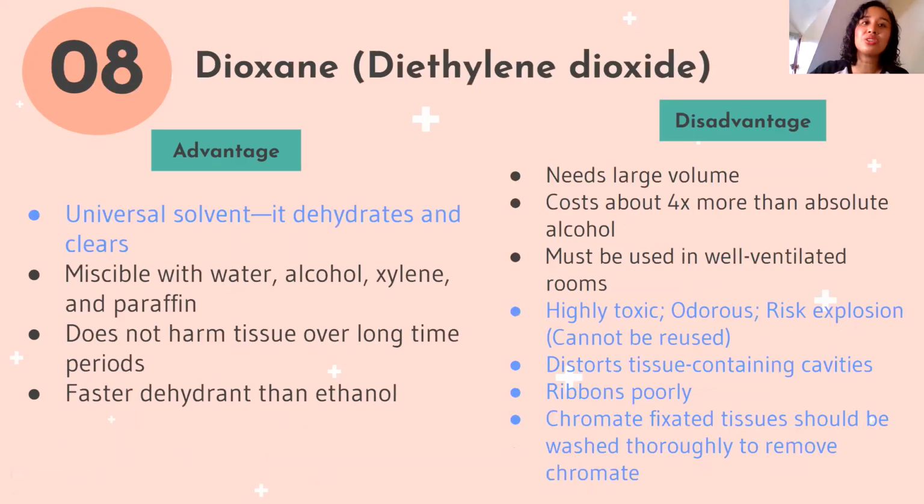Itong dioxane, dehydrating and clearing agent rin yan, ha? It does not harm the tissue over a long period of time. So, class, yung acetone, yung ethanol, pag masyadong matagal, it could brittle out the tissue. Ito, hindi. Ito naman yung advantage niya talaga. Kahit matagal siya, walang problema.